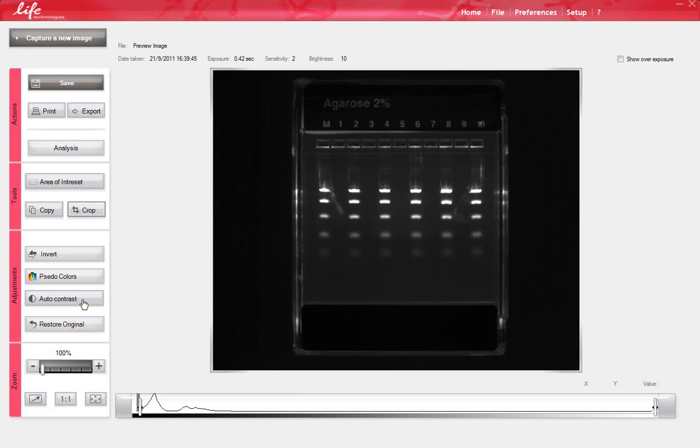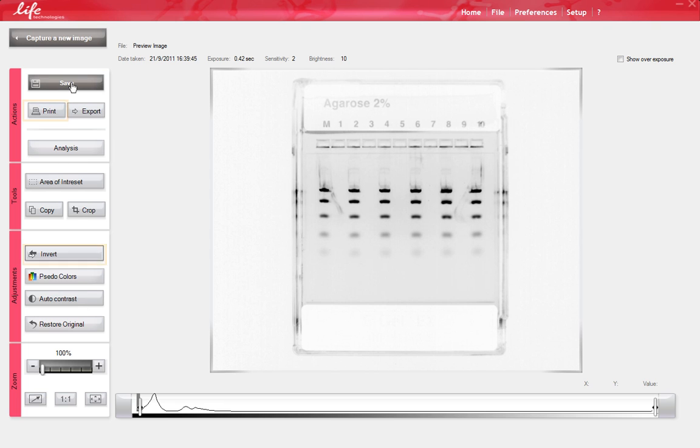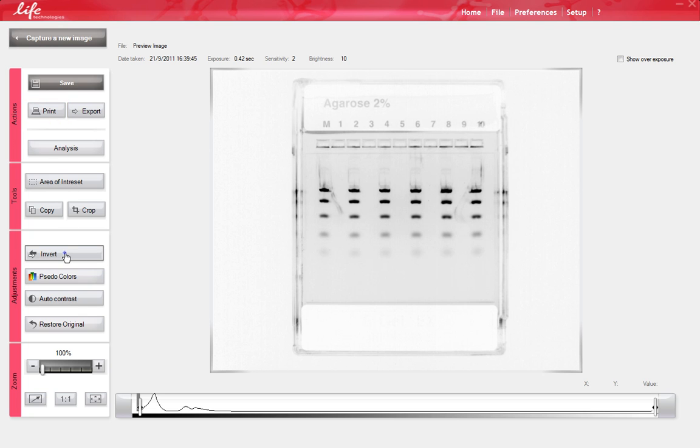Once you have captured the desired image, you may want to save, export, or print this image. To print the image, we recommend inverting the image colors and then selecting Print, followed by your normal printing procedures.